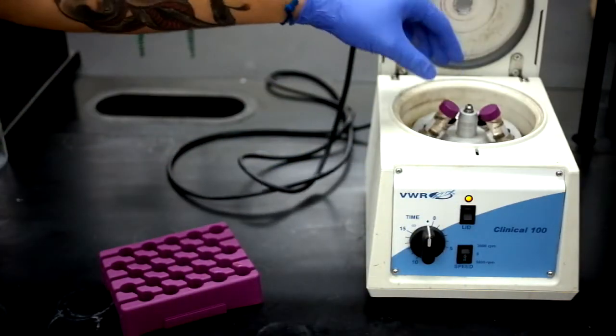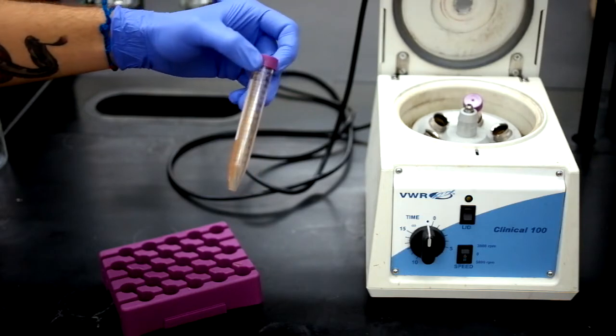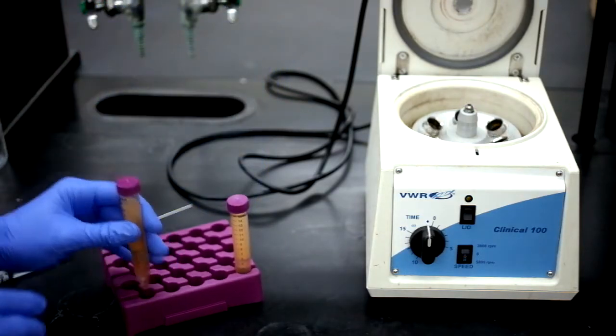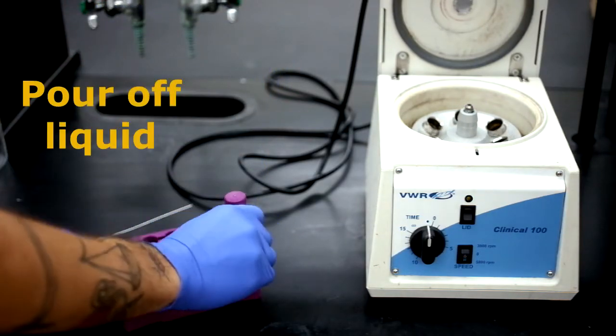After the tubes have stopped spinning, take them out and make sure that all of the nanoparticles have collected to one side of the tube. You can then pour off the liquid phase and save the nanoparticles.